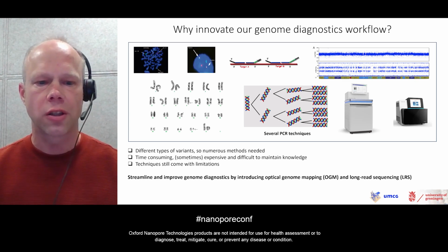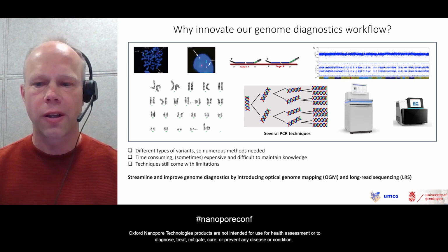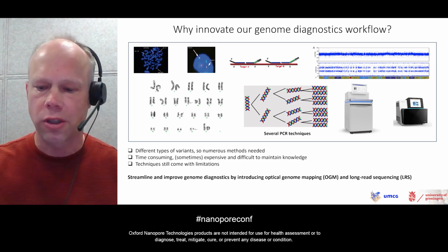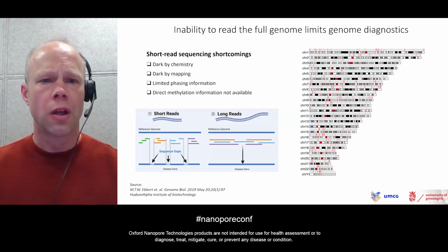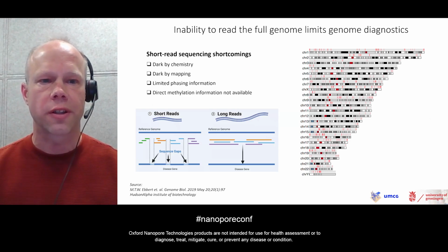For that reason, we want to replace the techniques array, karyotyping, and FISH with optical genome mapping, and replace the several PCR techniques that we use beside short-read sequencing with long-read sequencing. So why do we need the PCR techniques besides short-read sequencing?